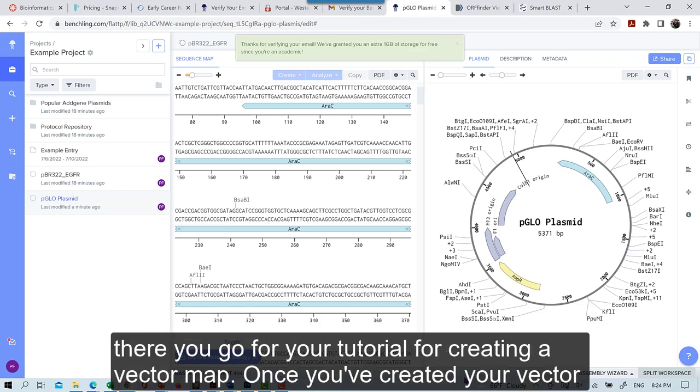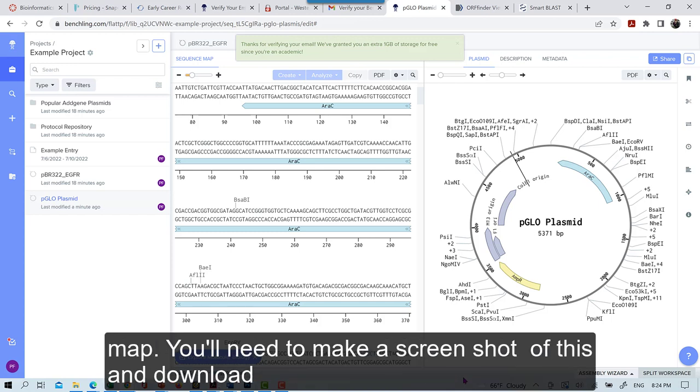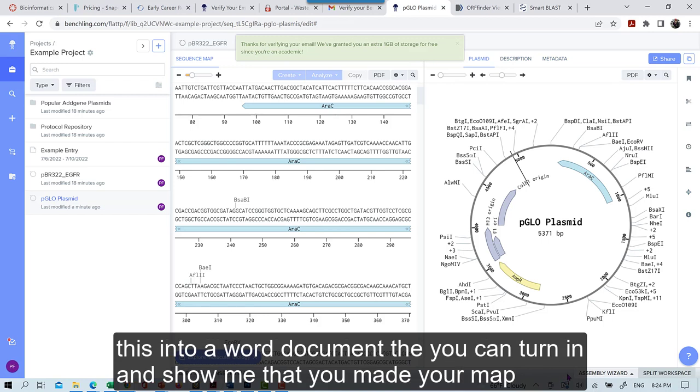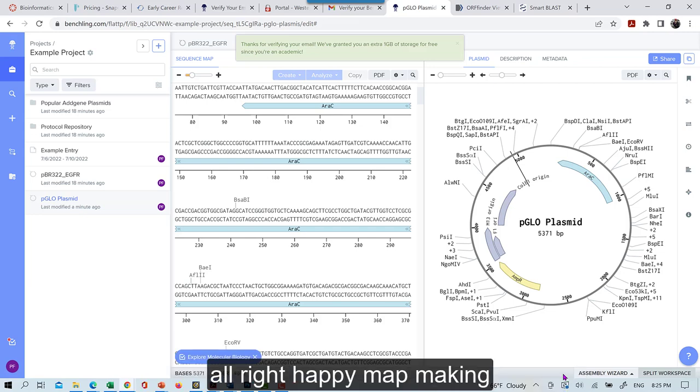Once you've created your vector map, you'll need to make a screenshot of this and download this into a Word document that you can turn in and show me that you made your map. Alright, happy map making!